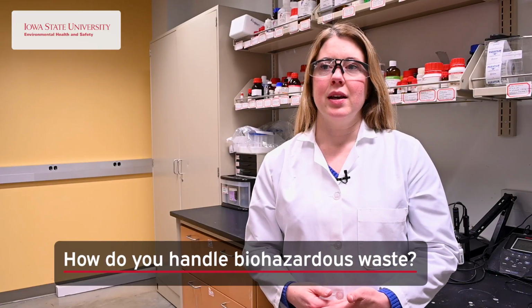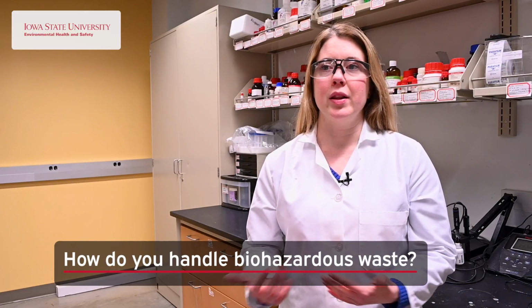My lab also generates some biohazardous waste. We segregate those depending on the waste type, whether they're sharp or not. And we also follow EH&S policies to make sure that they're properly decontaminated before they're disposed of.